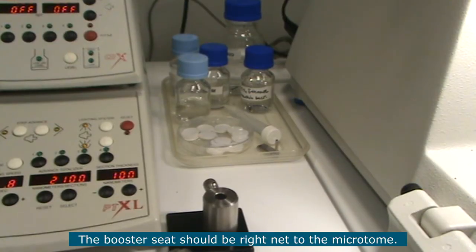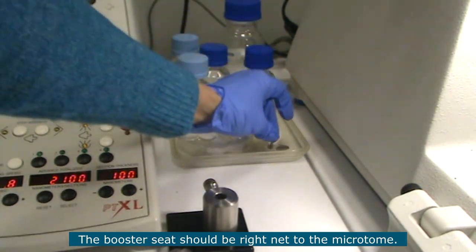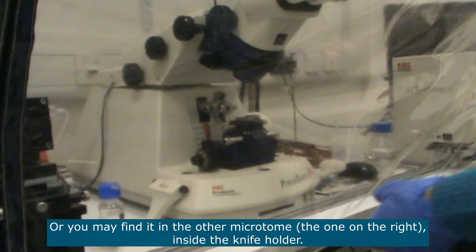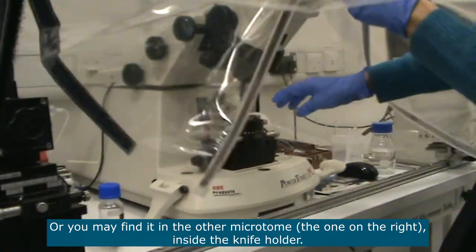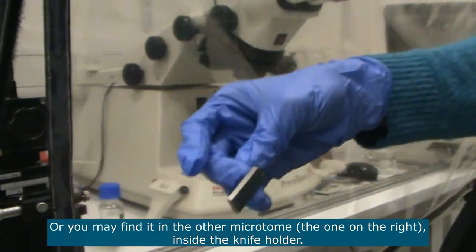The booster seat should be here right next to the microtome, or sometimes a user will have used the booster seat on the other microtome, so you'll be able to find it there.